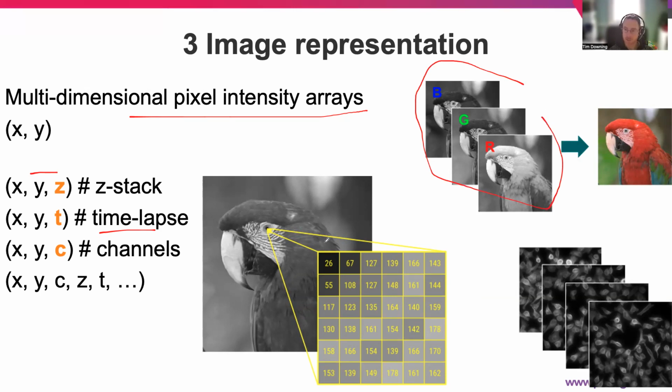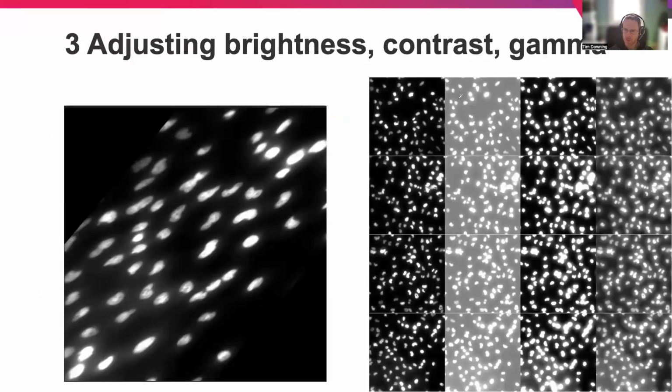We have different things that we can consider, XYZ dimensions as well. And therefore, if we're trying to bring up a single image, we can interpret that in one way as different channels, as the merged image, and then also images changing over time too. So that's what we'll explore in this course, is how we can create different images so you can see the same image with different levels of brightness here, and then also warp them like the RX image on the right here.